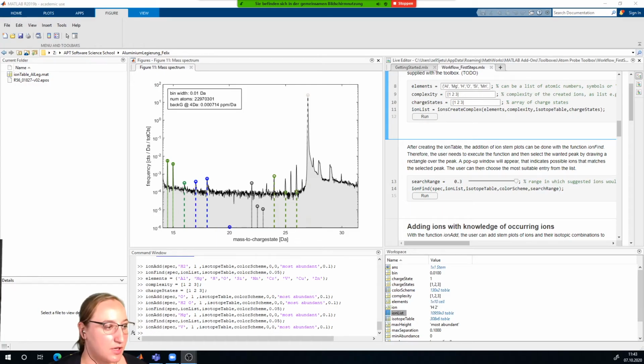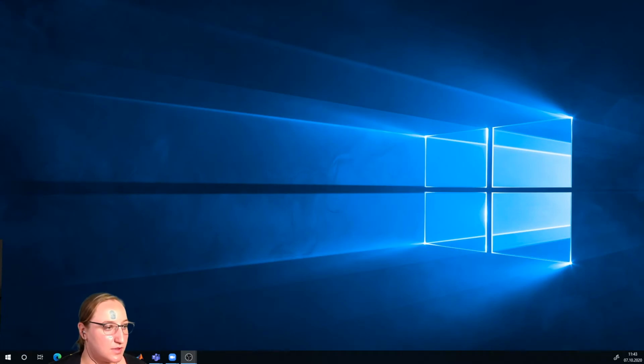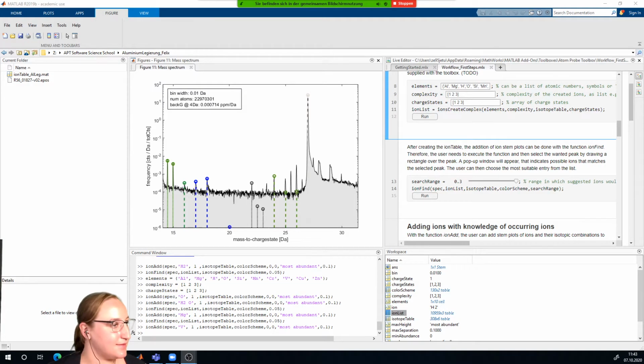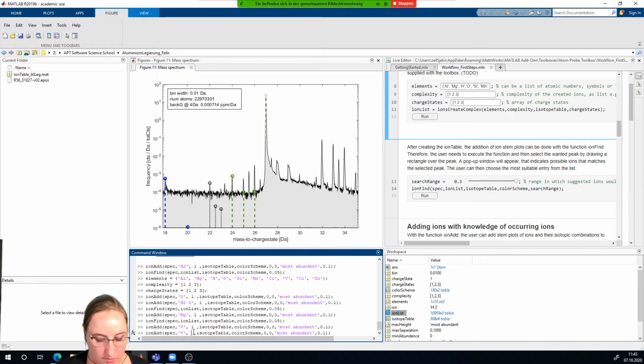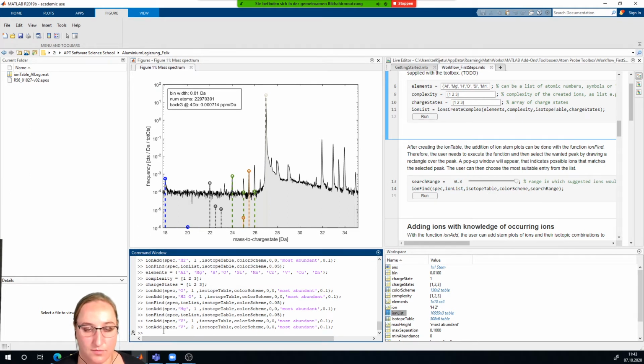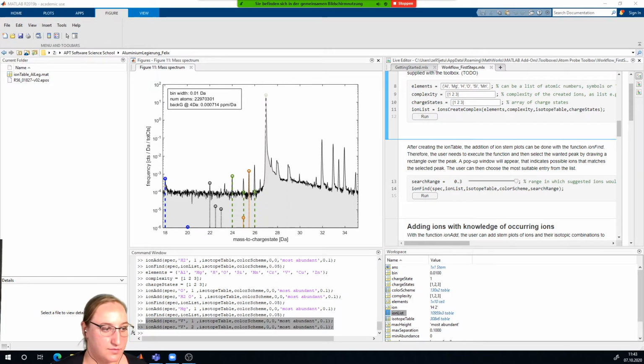Yeah, still recording. Okay, so let us continue. So we go for vanadium 2. Oh, sorry, the first one, not with the 1, because then you have to delete it again. Okay, what was my last one? The magnesium one is still missing.